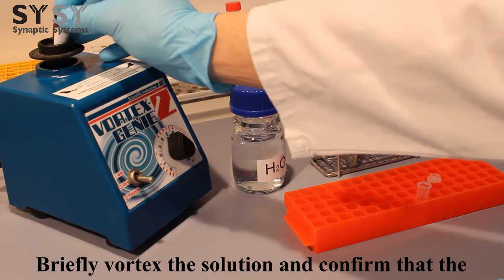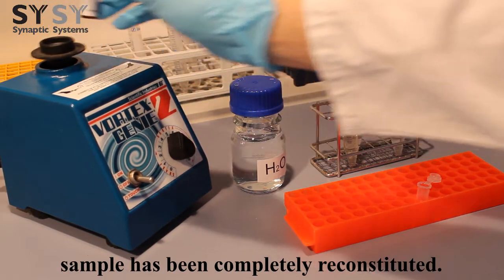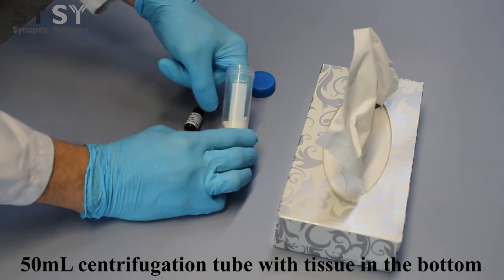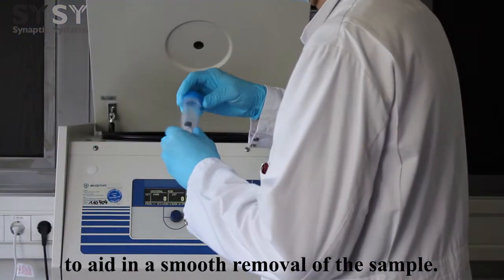Briefly vortex the solution and confirm that the sample has been completely reconstituted. Then, if desired, spin down the liquid by centrifugation. This can be done using a 50 milliliter centrifugation tube with a tissue in the bottom to aid in smooth removal of the sample.